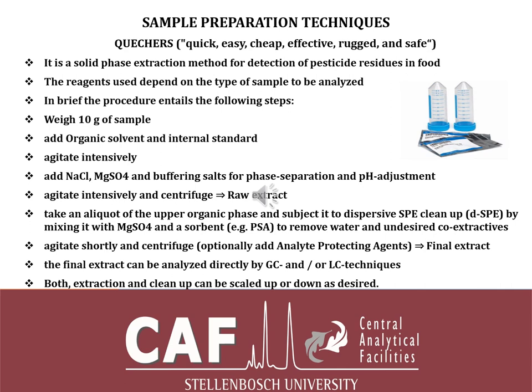The next sample prep technique that I want to talk about is QuEChERS: quick, easy, cheap, effective, rugged, and safe. This form of sample prep is a solid phase extraction method for detection of pesticides in food. It's used a lot, mostly in the food industry, for pesticide analysis. The reagents used depend on the type of sample to be analyzed.